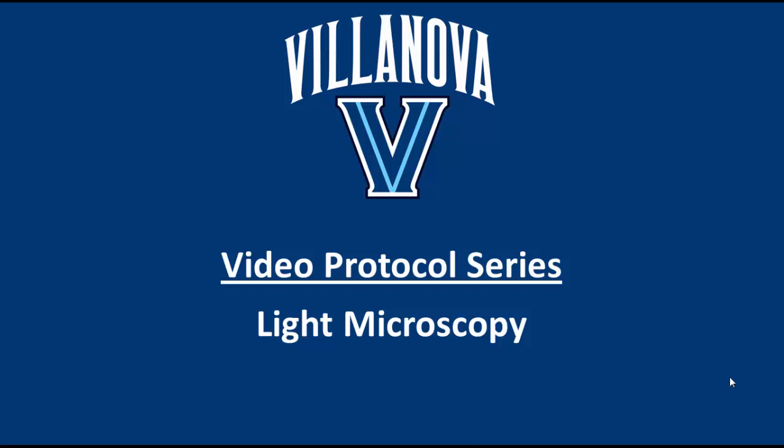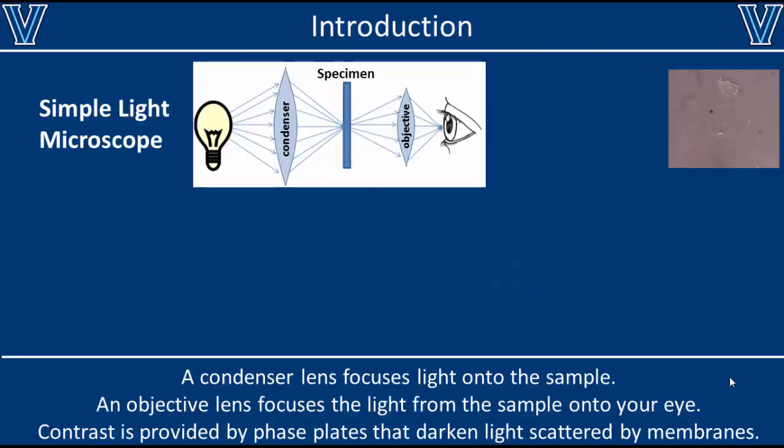In this module, we'll be talking about light microscopes, which represent the vast majority of microscopes you'll see in a laboratory setting. In their simplest form, a light microscope consists of 5 different parts. First of all, you have a light source that emits light in all different directions. This light is collected and focused on the specimen with a condenser lens.